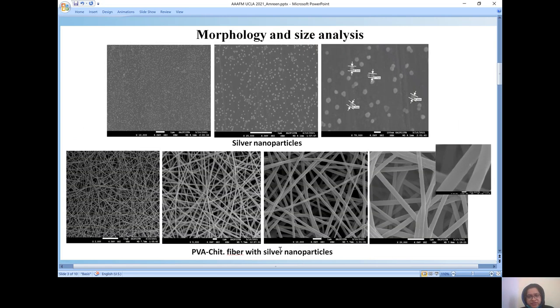For the characterization, we opted first for scanning electron microscopy to confirm the silver nanoparticle and PVA chitosan fibers formation, wherein the spherical structure of the AgNP confirmed morphology. Further, the size also was estimated to be around 60 nanometers, wherein in case of the fibers incorporated with the nanoparticles showed the morphology and width to be of 200 to 300 nanometers. The inset shows that there are the nanoparticles present.